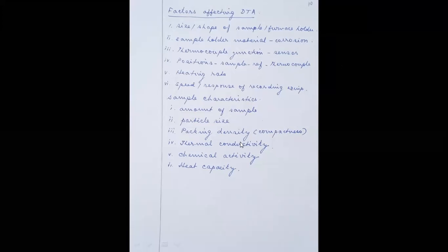Now you see, another one is the packing density, compactness, which means even we can say it is the density, how together the molecules are packed, whether they are loosely packed, whether they are tightly packed. So that compactness, how they are packed, that also plays an important role.